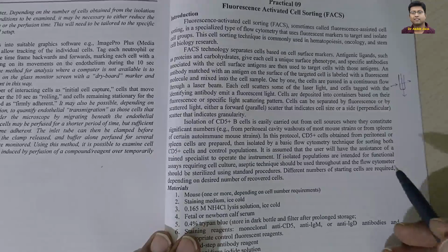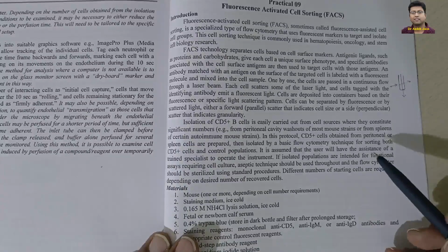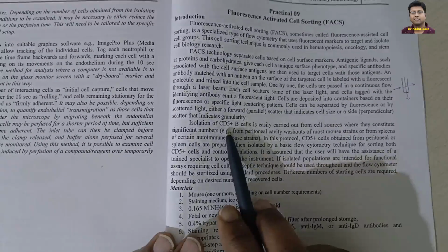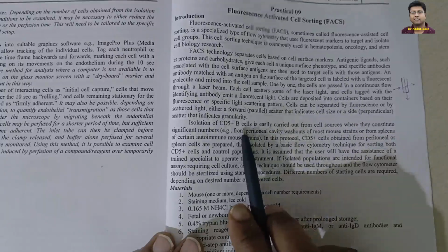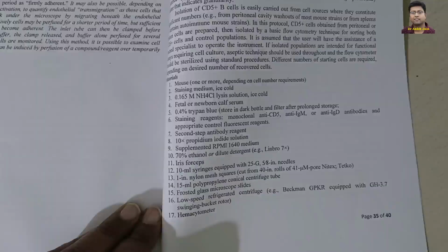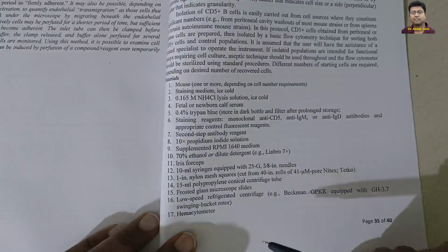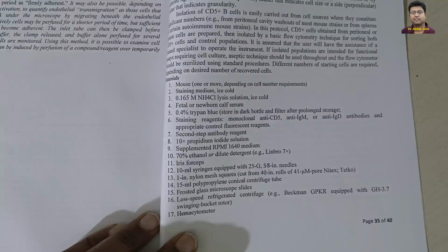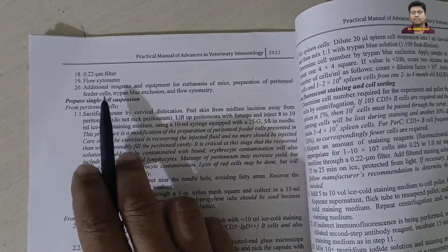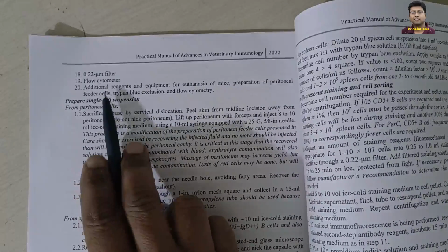So under this practical we have to separate and isolate CD5 B cells. CD5 positive B cells are to be identified with the help of a fluorescence activated cell sorting system. These are the following materials which are required during our experimentation. These are also items which are required, and it is a continuation of the previous page.